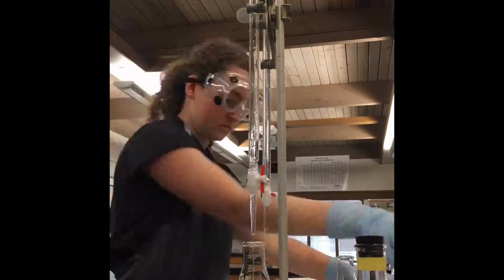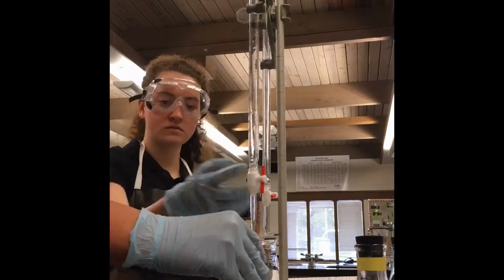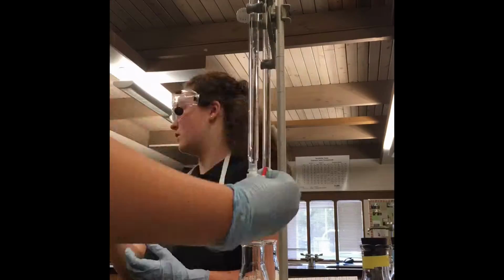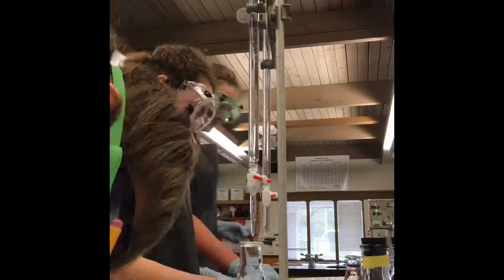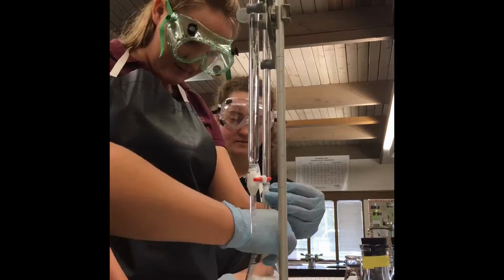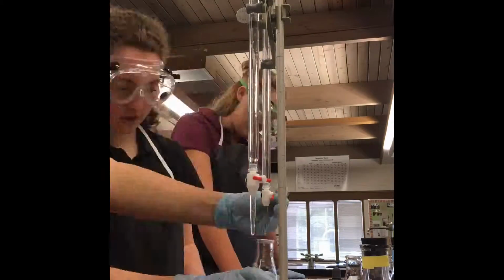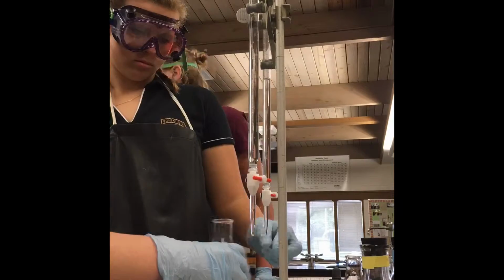First, the burettes needed to be cleaned when switching from one acid to another. The acid was rinsed through the burette 3 times to ensure that there was no other acid still present in the burette. Then the acid and the base were filled with their respective solutions. Each burette at that time was recorded with their initial volumes.